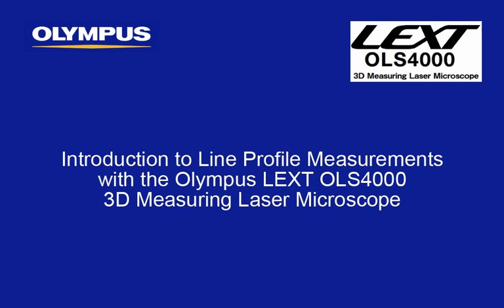This tutorial is one of the many instructional videos presented by the Olympus America Scientific Equipment Group, Industrial Microscopes. This tutorial will provide you with detailed instructions on getting started with line profile measurements with the Olympus LEXT OLS4000 3D Measuring Laser Microscope.